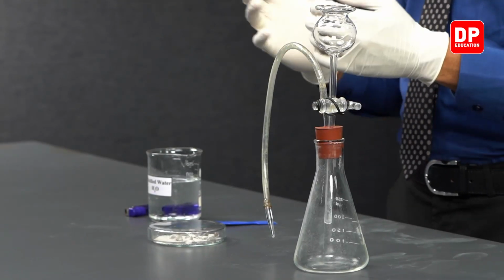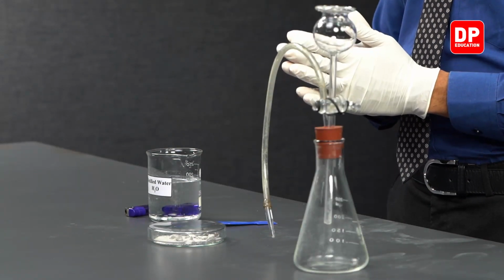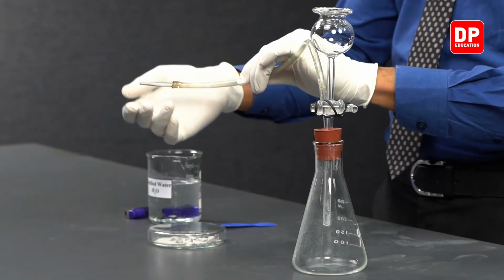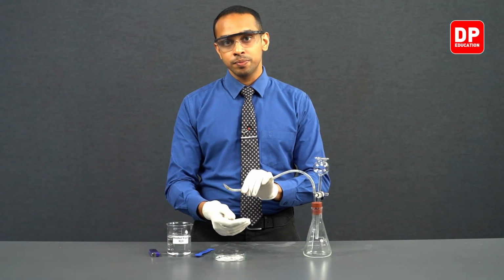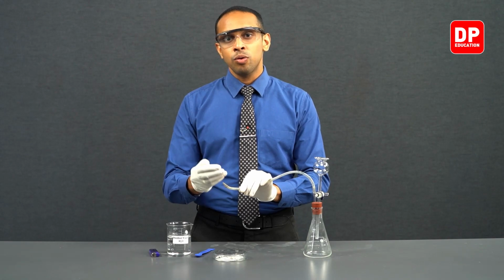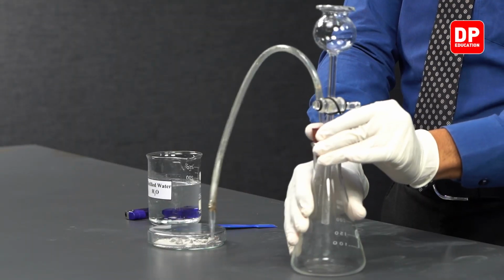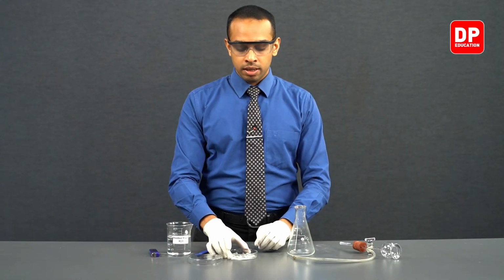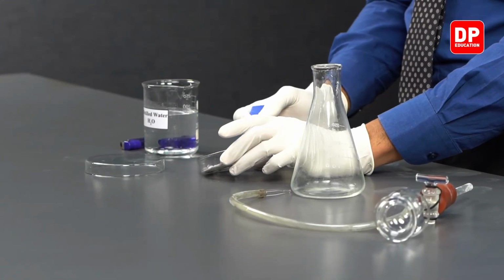Now students, as a small additional part to our experiment, we are going to add water to calcium carbide and produce acetylene gas, and we are going to see how the acetylene gas burns in air. So as acetylene gas is produced and delivered through this delivery tube, we are going to burn the acetylene gas that is produced here, and we are going to observe how acetylene gas burns when we burn it in air. So let's first remove the stopper here and take our calcium carbide that we have here. We'll take a small amount of calcium carbide.